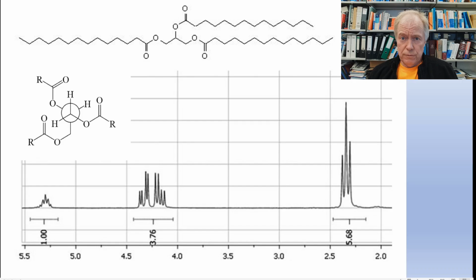Okay, so we keep in mind, if we have diastereotopic protons, a more complex coupling pattern will usually arise.